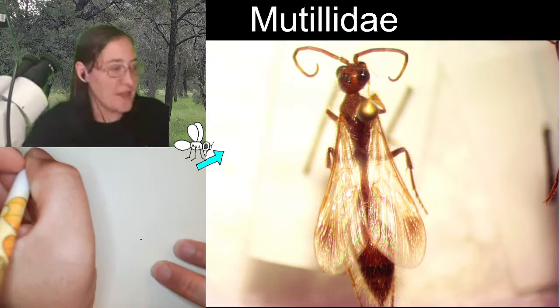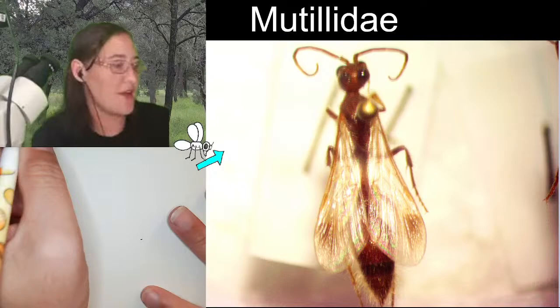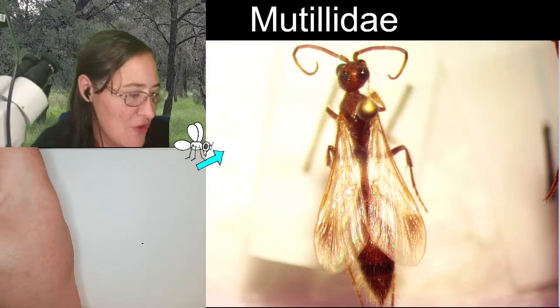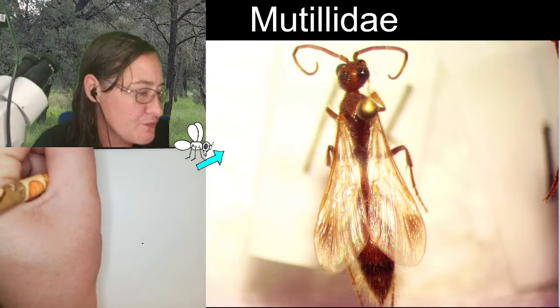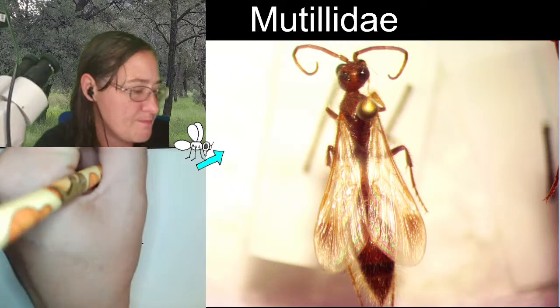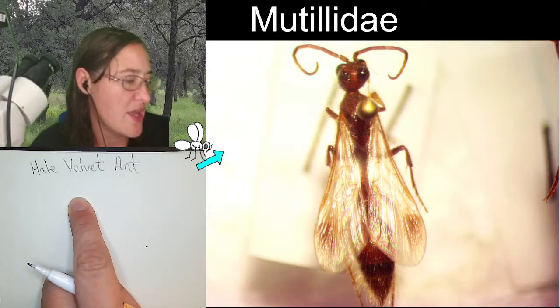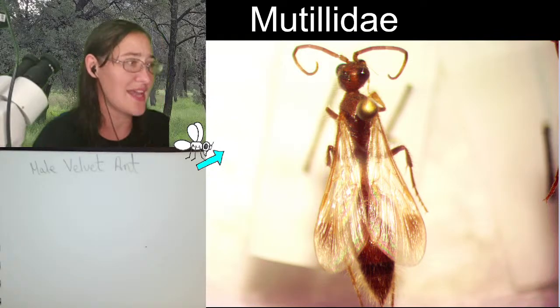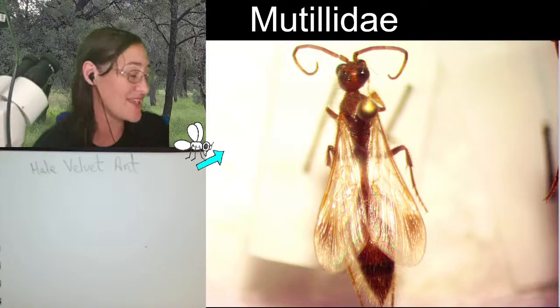There we go. Alrighty. I don't know identification of the mutilid past the family level, so I'm just going to write male velvet ant. Now, this velvet ant was collected at nighttime. There are a series of velvet ants that are actually nocturnal.